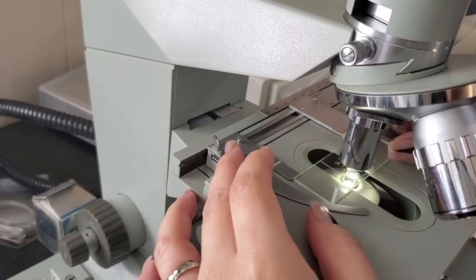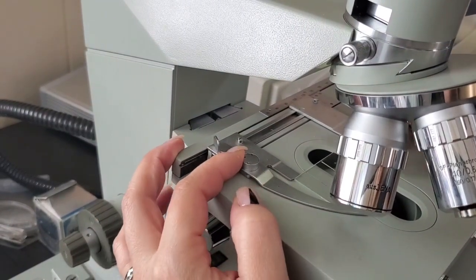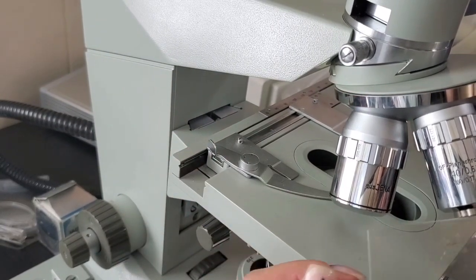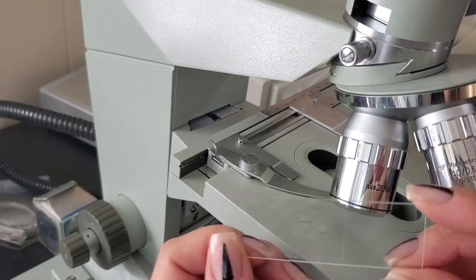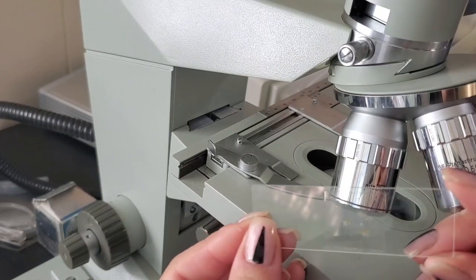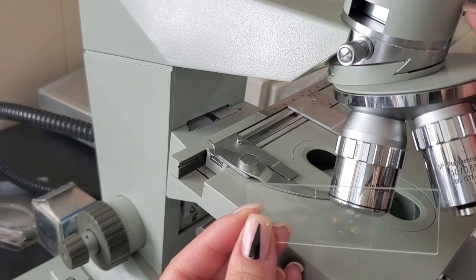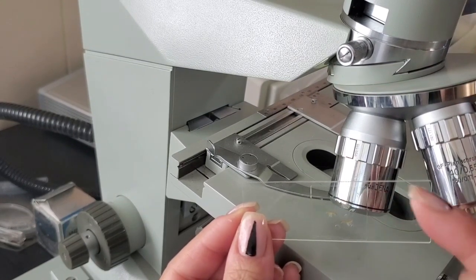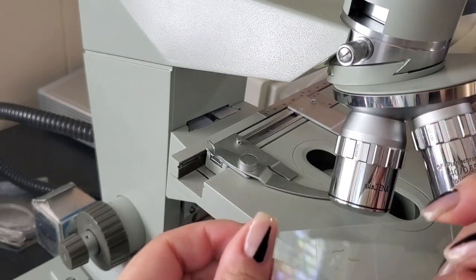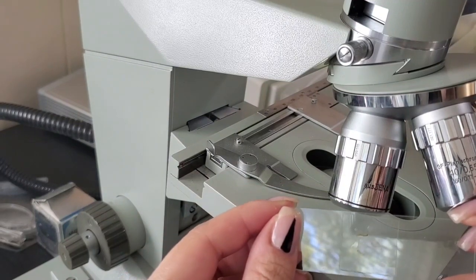All right, so I actually already placed my slide, but let me just show you how to properly use a microscope. So you want to always have it where there's no objective in position, and remember that images in a microscope are inverted and upside down. So if I were to place the slide in a way that made sense to me, in reality, when we look at it via the microscope, instead of the gills facing down, they're all going to be facing upwards. So I'm actually purposely placing it so that it's backwards to me. Well, I should say upside down.